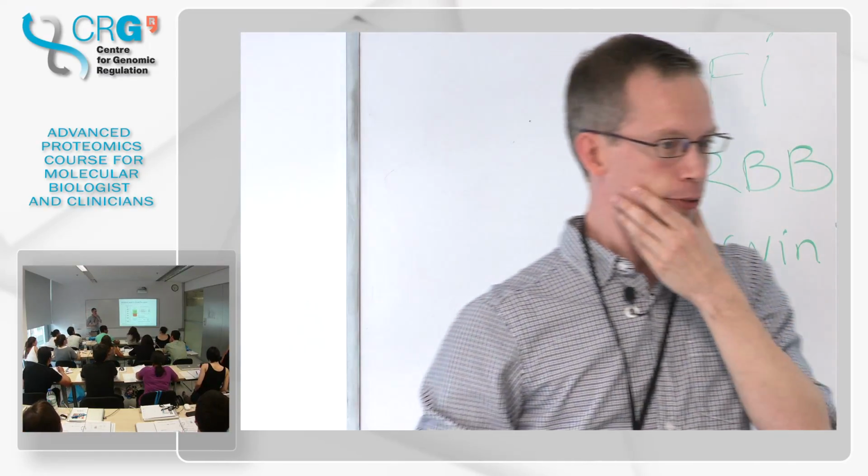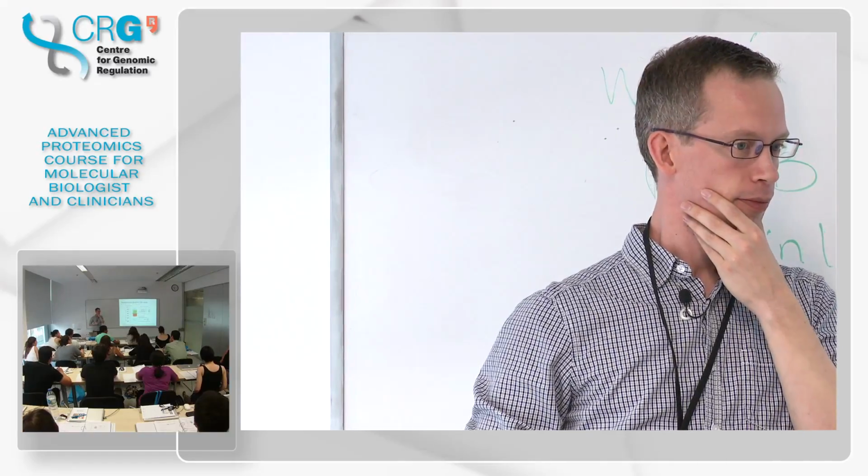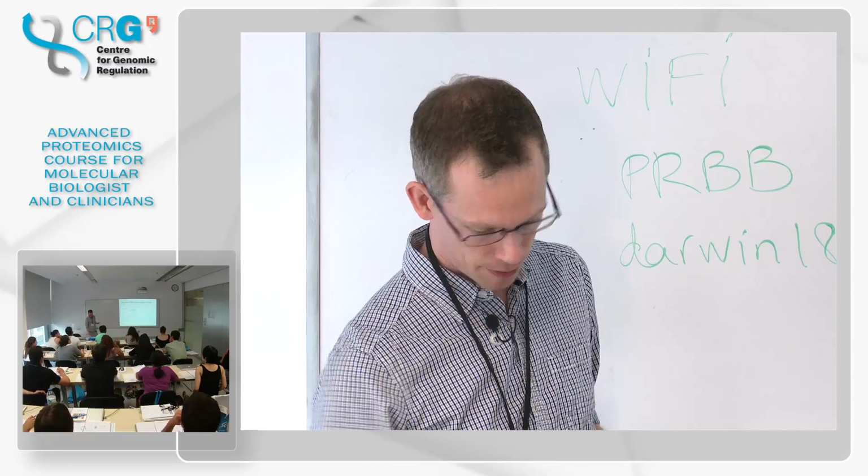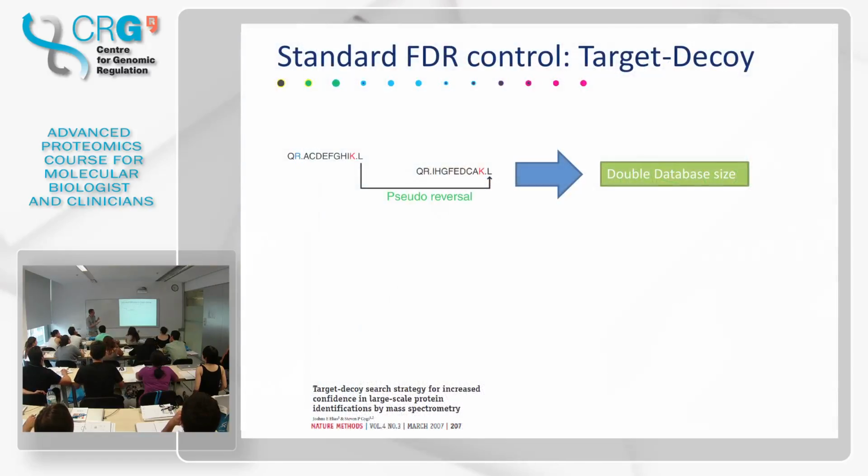I understand why the mass changes when you reverse the ends, because arginine does not weigh the same as lysine. So here you have the masses, or the amino acids, you have here are exactly the same as the amino acids you have here. Does that make sense? Yeah.